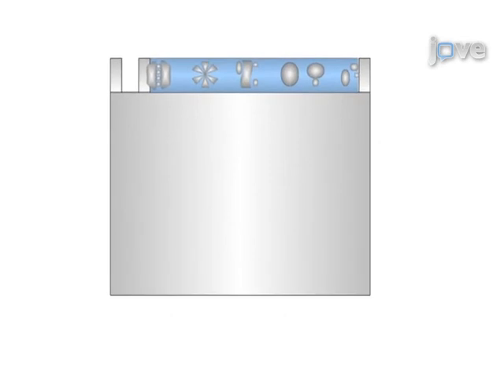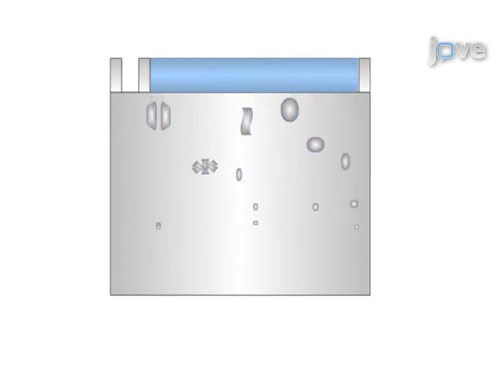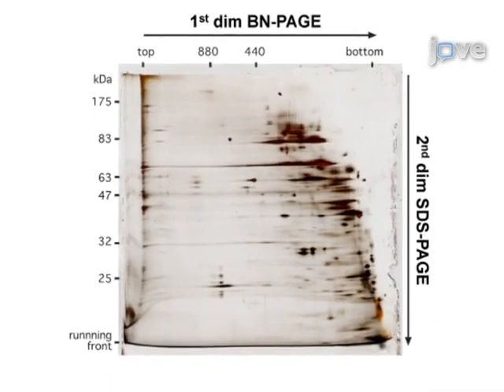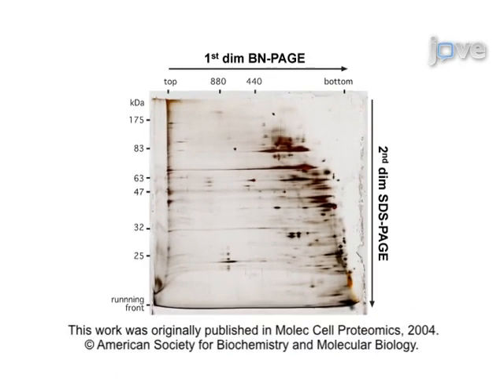Next, a second dimension denaturing SDS-PAGE is performed in order to subdivide the complexes into their individual constituents. Proteins can be visualized by silver or Coomassie staining or Western blotting. Here, separated proteins were detected by silver stain. In the following demonstration, however, Western blotting will be used.